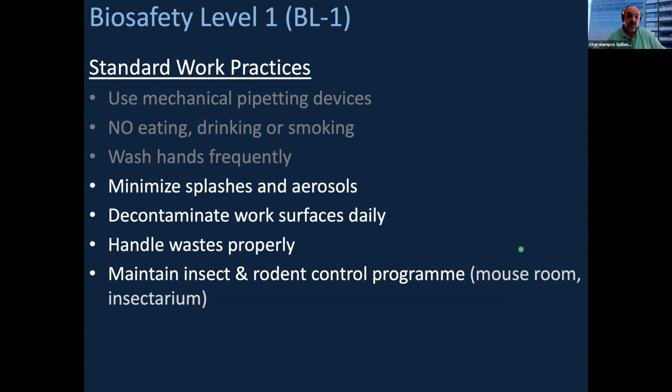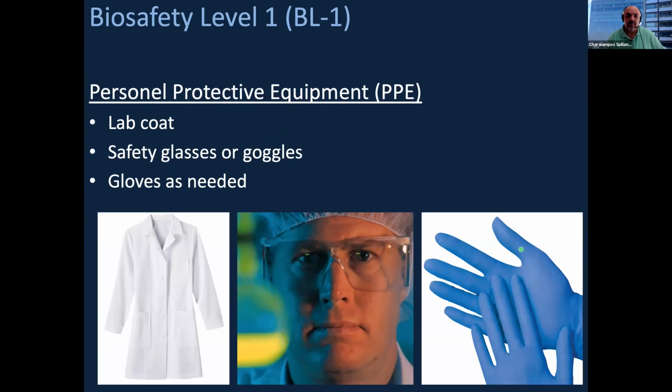We should decontaminate the work surface daily. I would say even not once, but many times within a day, especially after certain experiments, we should decontaminate our bench. Waste should be handled properly. And we should have, for example, an insectarium and a mouse room, and we do have these at the IMBB in order to breed, let's say, insects or mice.